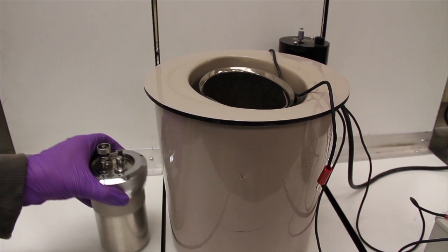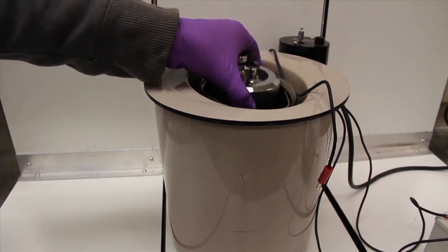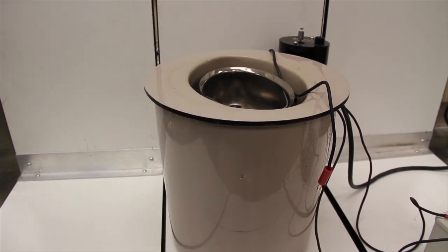After the bomb has been purged twice and pressurized with 25 atmospheres of oxygen, load the bomb into the calorimeter and add 2 liters of water from a volumetric flask.